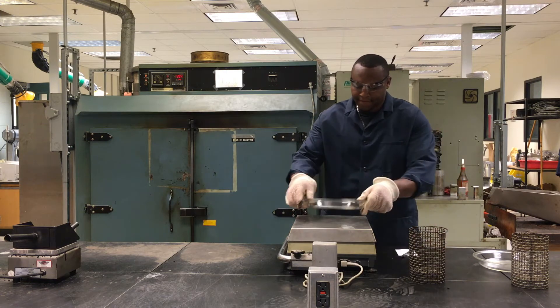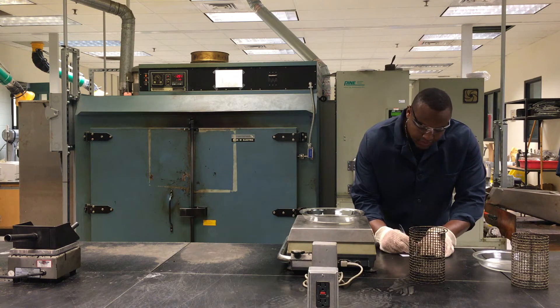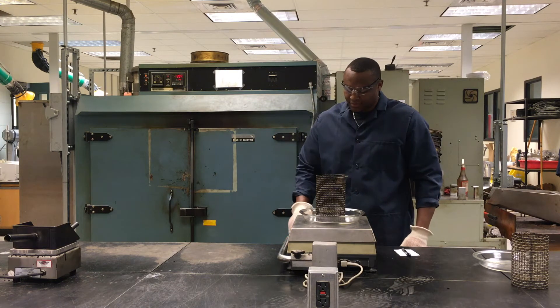Weigh a metal or glass plate to the nearest 0.1 gram and record the weight as PI. Leave the plate on the balance and place the wire basket on the plate. Tare the balance.